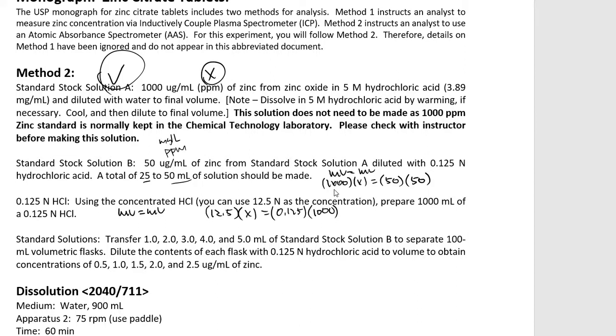One of the things I want to say here, though, is this concentrated hydrochloric will smoke when you make the sample. So don't be alarmed, don't be surprised. It will do it. It will generate some heat. I just hope it doesn't blow up in your face, so do it under a fume hood if possible.